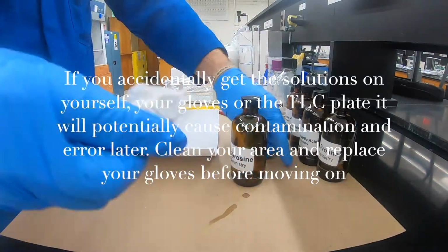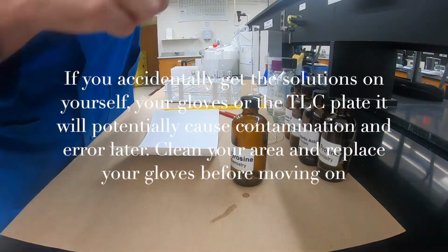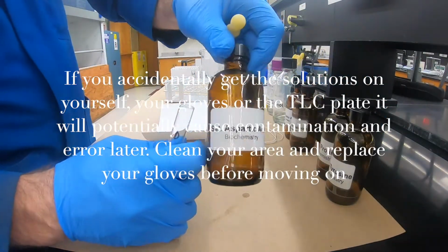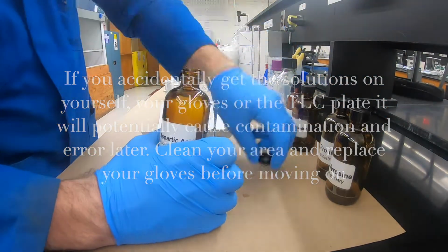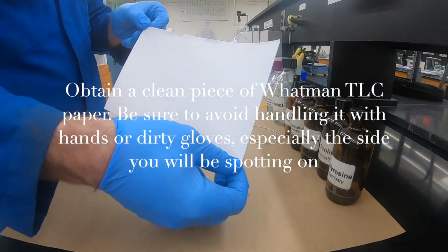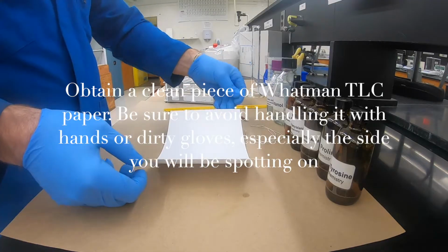If you get any of the solution on yourself, make sure that you get rid of your gloves and clean the area. Replace anything that needs to be replaced because cross-contamination is a huge problem. Get yourself a clean piece of Whatman TLC paper. Make sure your hands are clean before you start handling it.